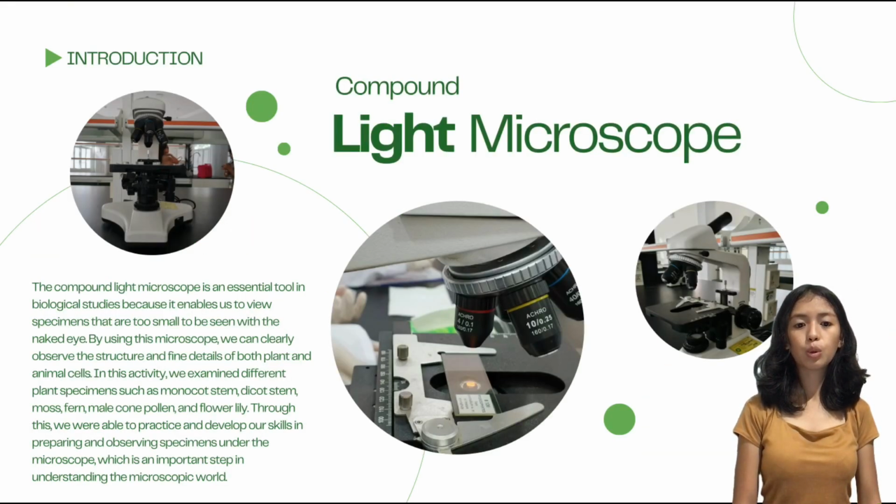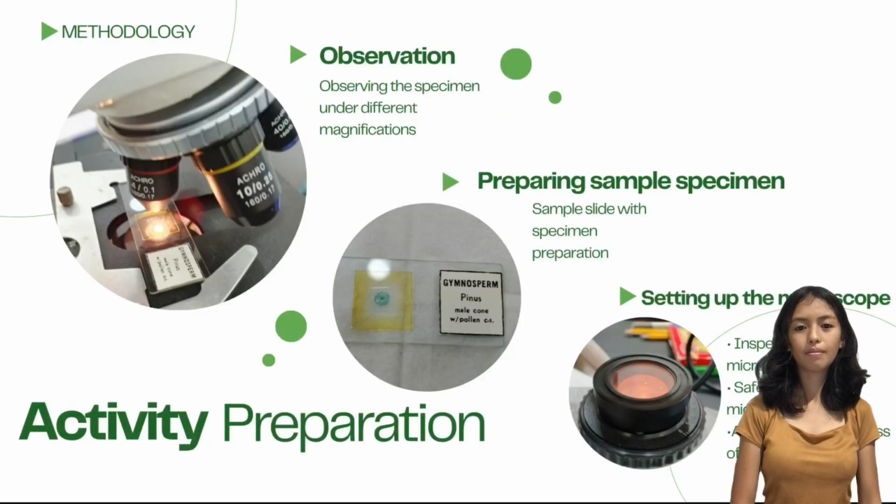Microscope is a crucial tool in various scientific fields because it allows us to visualize and observe objects and find details of plants and animal cells that are too small to be seen with the naked eye. With this, we are to observe some plant specimens such as monocot stem, dicot stem, moss, fern, male cone pollen, and flower lily, to exercise our skill on using microscope by observing those specimens.